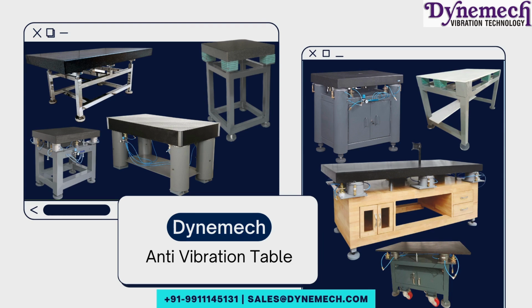So, how do you select anti-vibration tables for an application? Yeah, we do the selections actually. So it depends upon many factors, such as the type of the equipment which needs to be isolated, weight of the equipment, and the location of the site, if it is on the solid ground floor or it is being installed on a suspended slab, or it is going to be installed on a third, fourth, or fifth floor of a multi-story building.